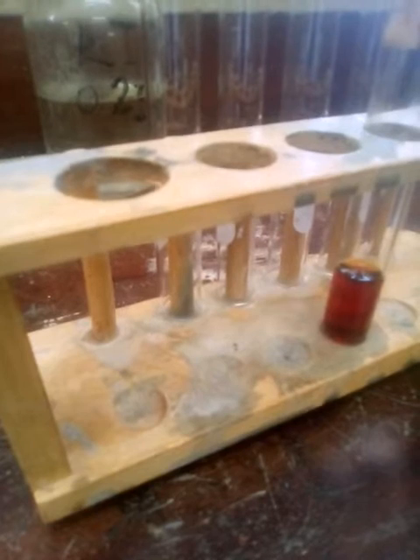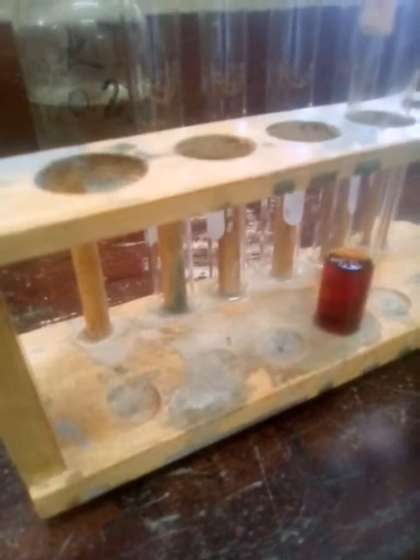I'm seeing effervescence, I'm seeing bubbles, and that would imply that a reaction took place. Let me give a close up to see if you guys can see. The bubbles are not enormous, so you probably will not be able to see them through the phone, but I am seeing some bubbles, and those bubbles would be coming from the decomposition of the hydrogen peroxide, which is liberating oxygen gas.